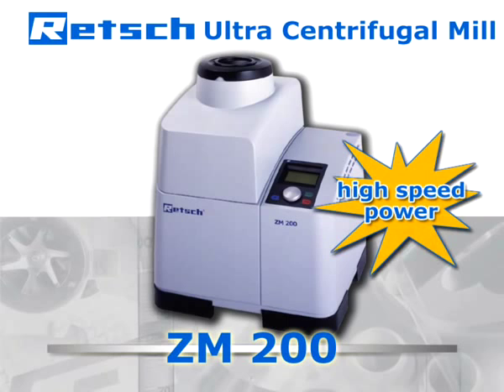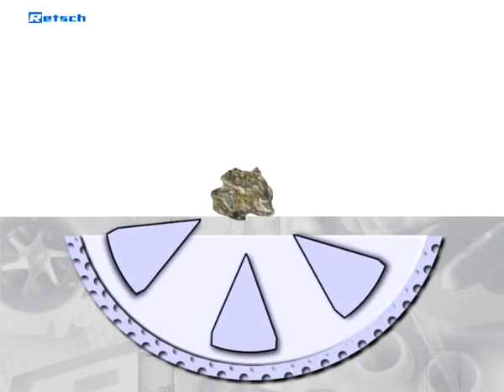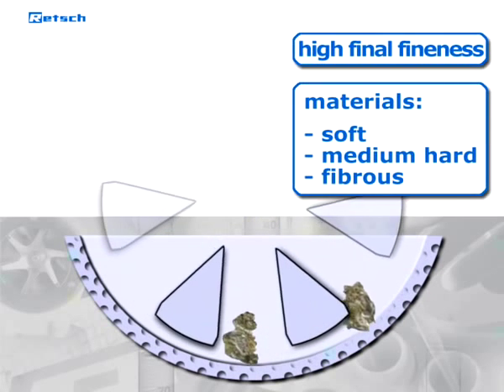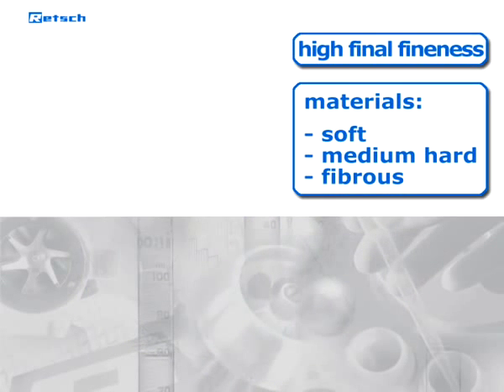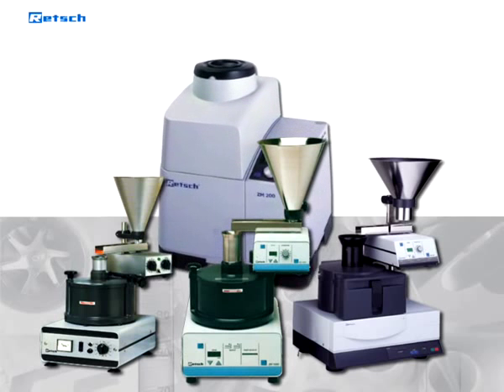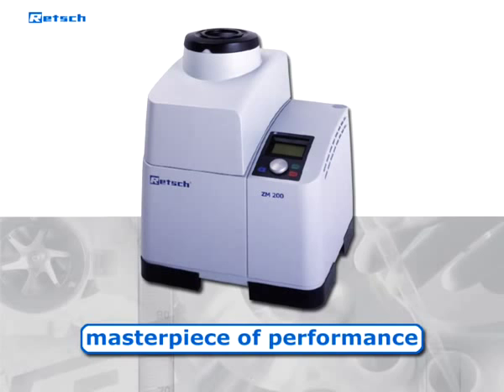This high-speed rotor mill allows for rapid but also gentle size reduction and for achieving a high final fineness of soft-to-medium hard and fibrous materials. Our ultra-centrifugal mills have been on the market for decades and became Retsch's flagship products. The latest version, ZM200, is a masterpiece of performance and ease-of-use.